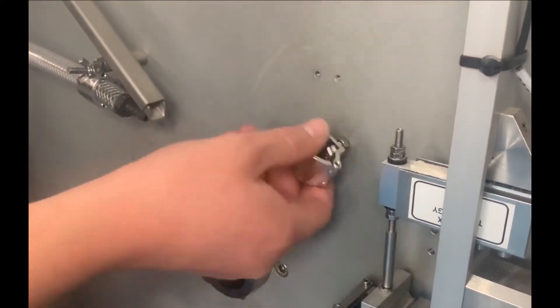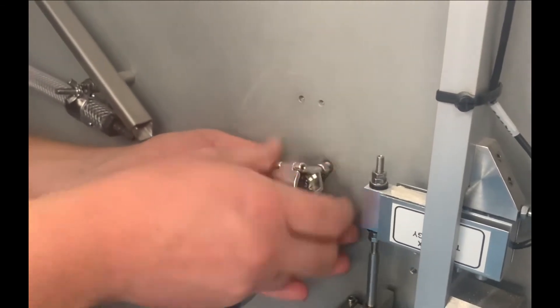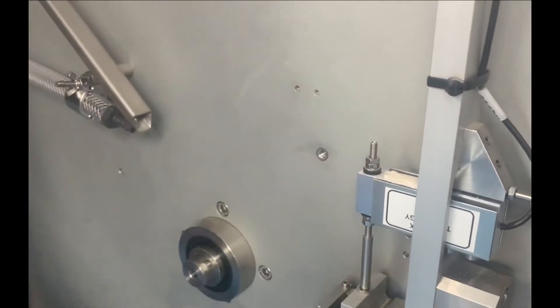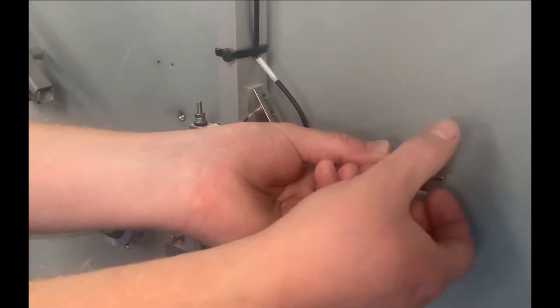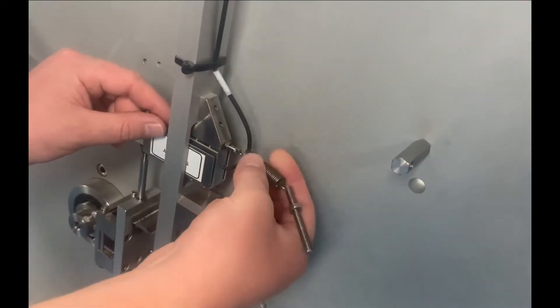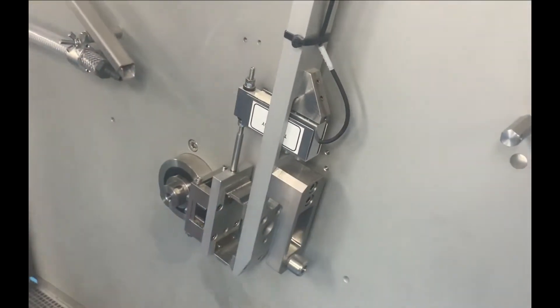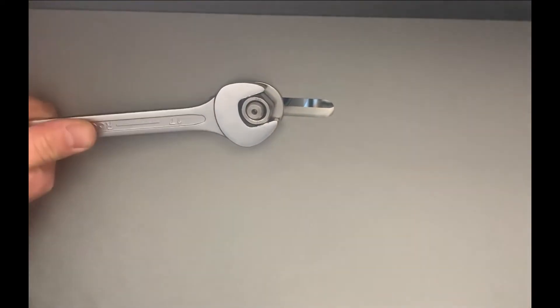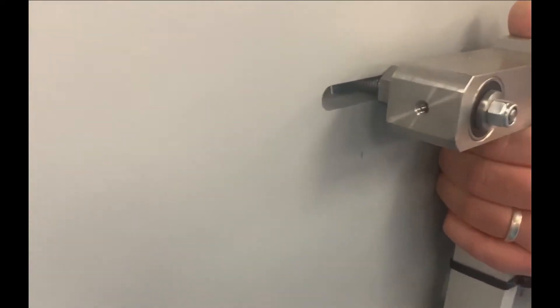Now remove the abradant nozzle clamp and the counterbalance spring. Undo the nut securing the load arm to the back plate and place the load arm on the bottom of the chamber.